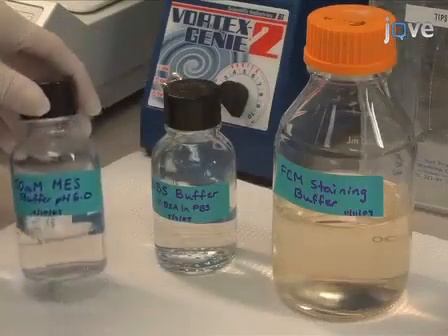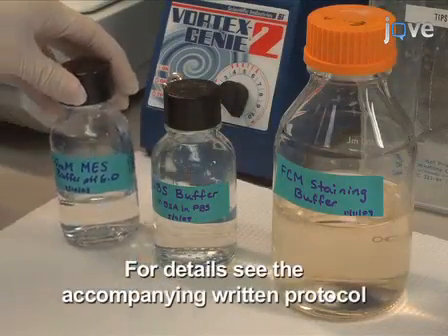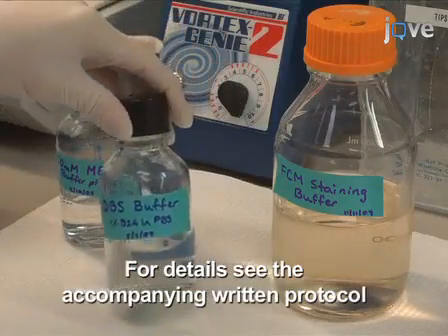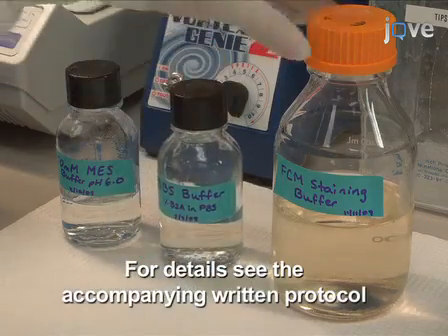To begin this procedure, prepare the following buffers: MES coupling buffer, quenching blocking storage buffer, abbreviated QBS, and flow cytometry or FCM buffer.